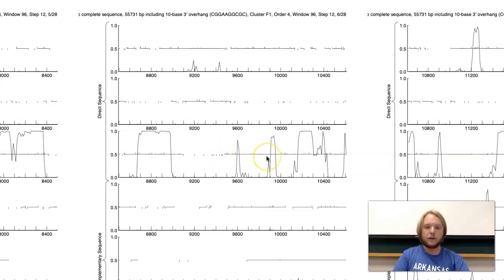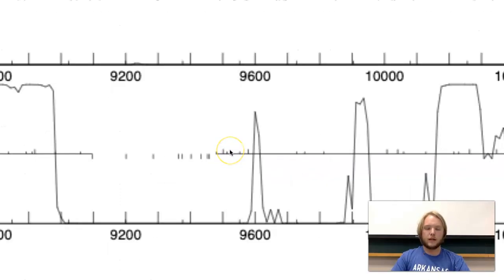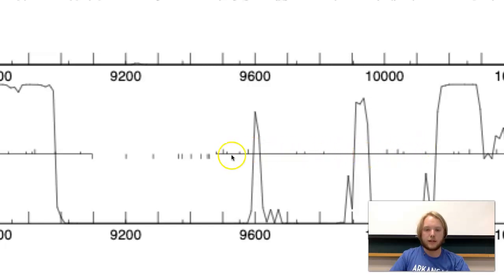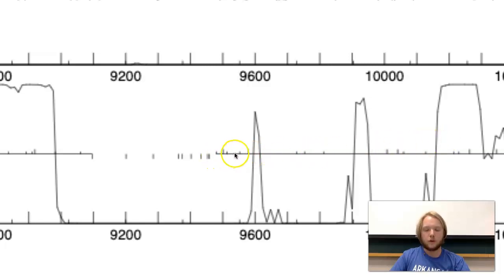Now that you know what these spikes are, I'm going to explain the upticks, the downticks, and the line. The upticks each represent a start codon. If you remember, each start codon can also code for a certain amino acid. Because of this, each gene has numerous upticks inside of it because it's just indicating the presence of a potential start codon. Not all of these will be new starts because they're all inside the same gene before another stop codon appears. It's our job to find out which codon is actually a start and which codon is just another amino acid.